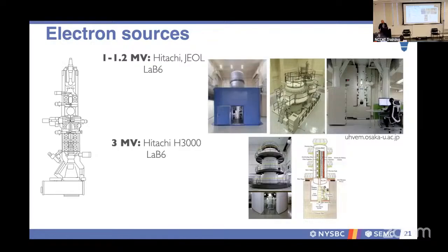There are higher keV microscopes. There are megavolt microscopes, and they're very tall. You saw a Krios that's pretty tall. Some of these are 2 or 3 stories tall. Why would you want to use some of these microscopes? Let's say you have a sample that's thicker than 100 nanometers. Let's say you have several microns. You can use some of these microscopes to have deeper penetration depth.